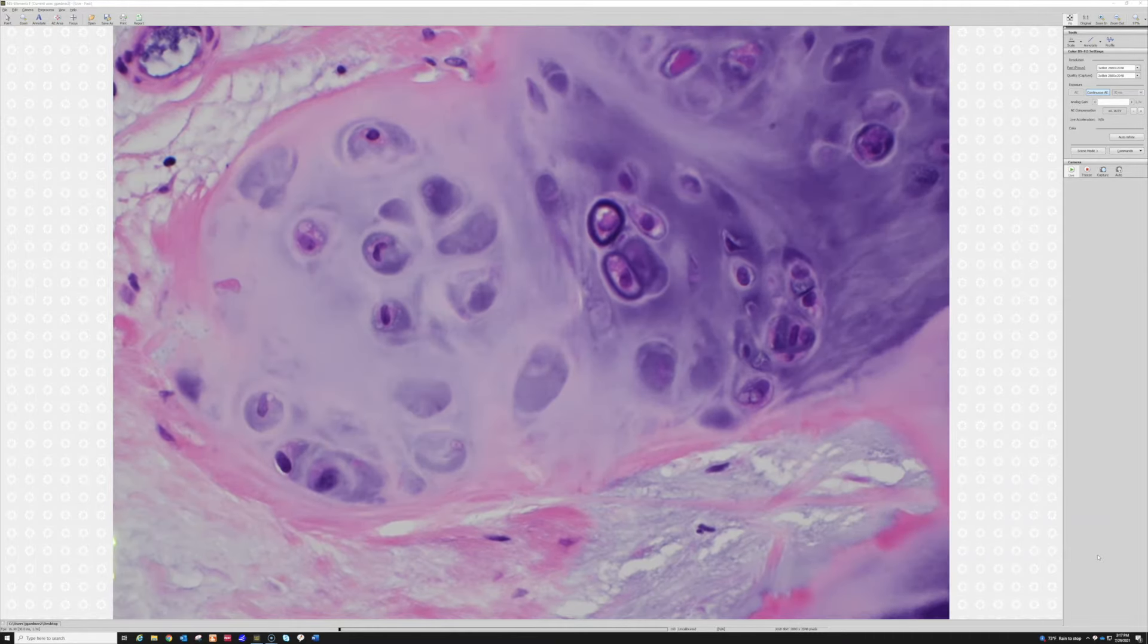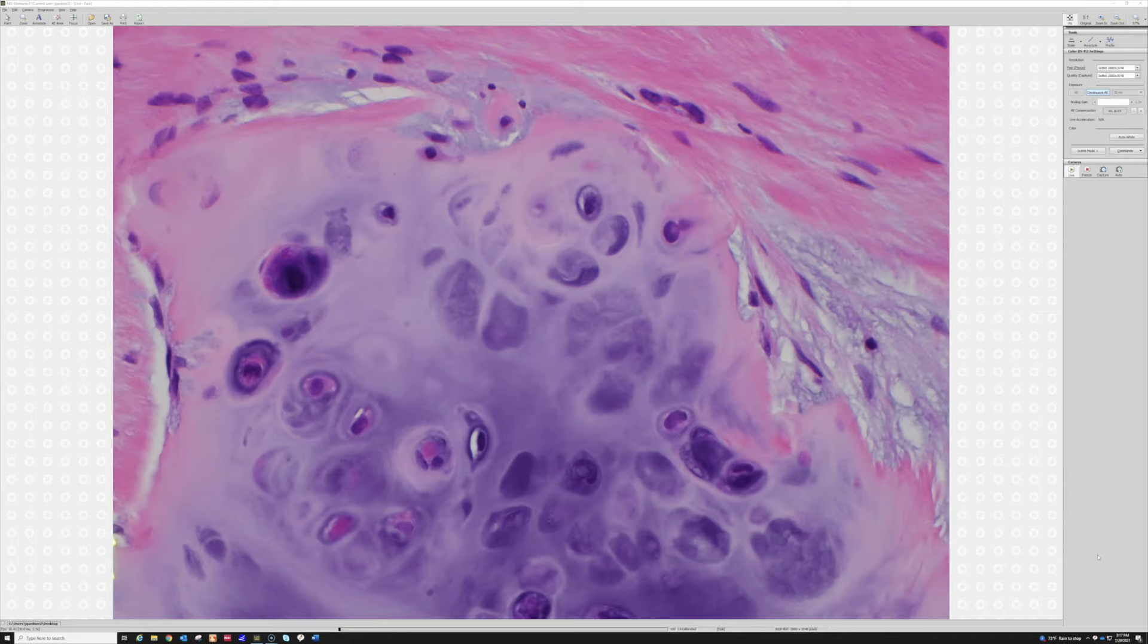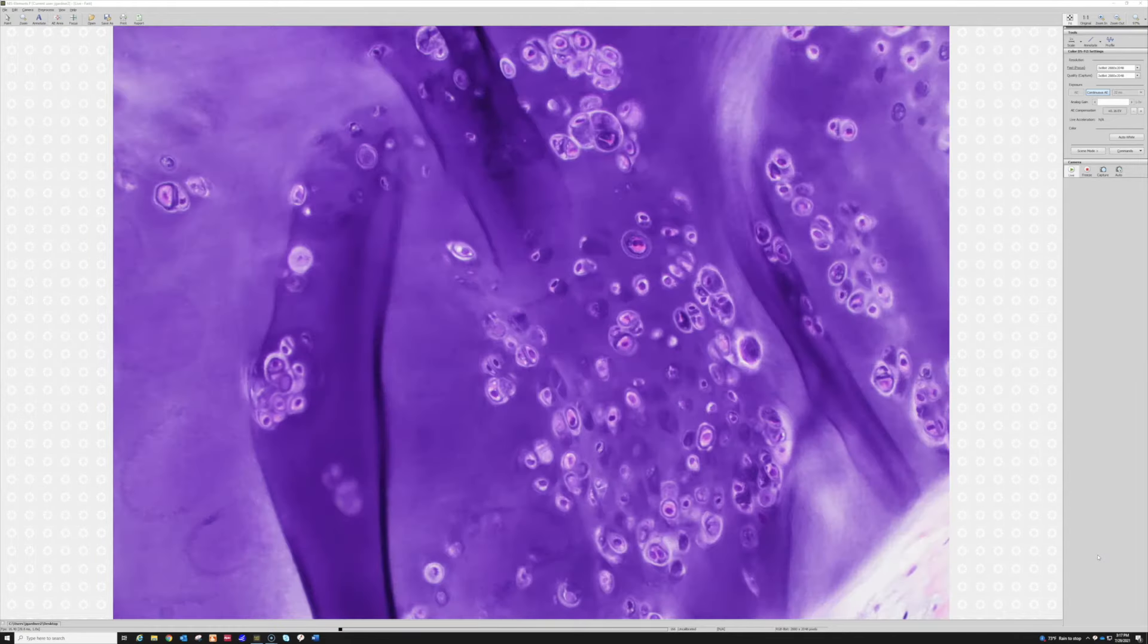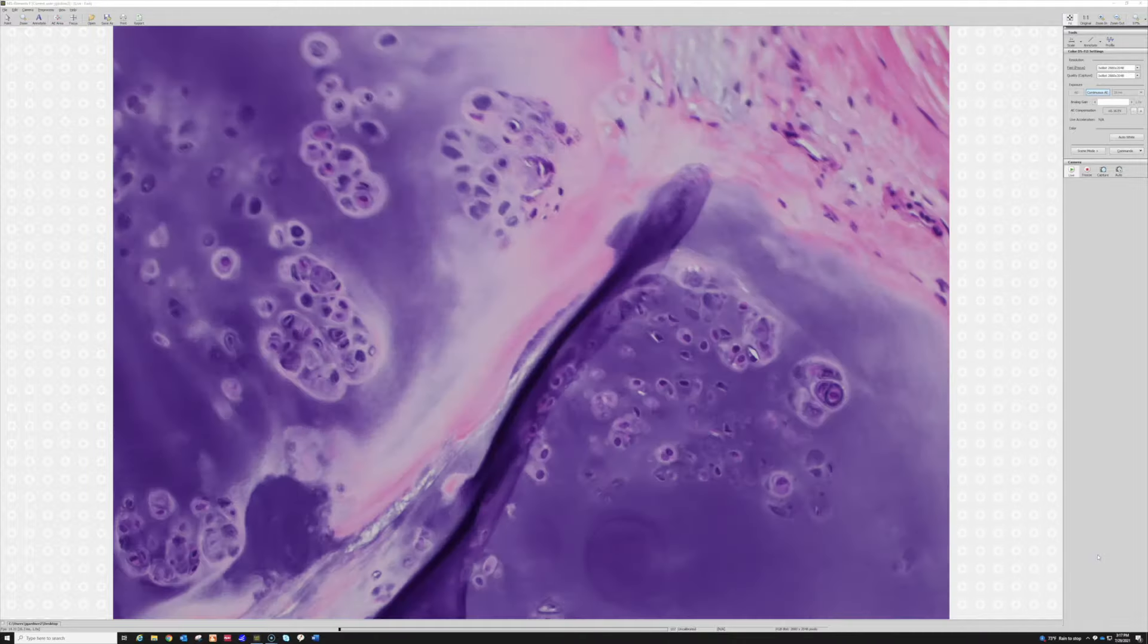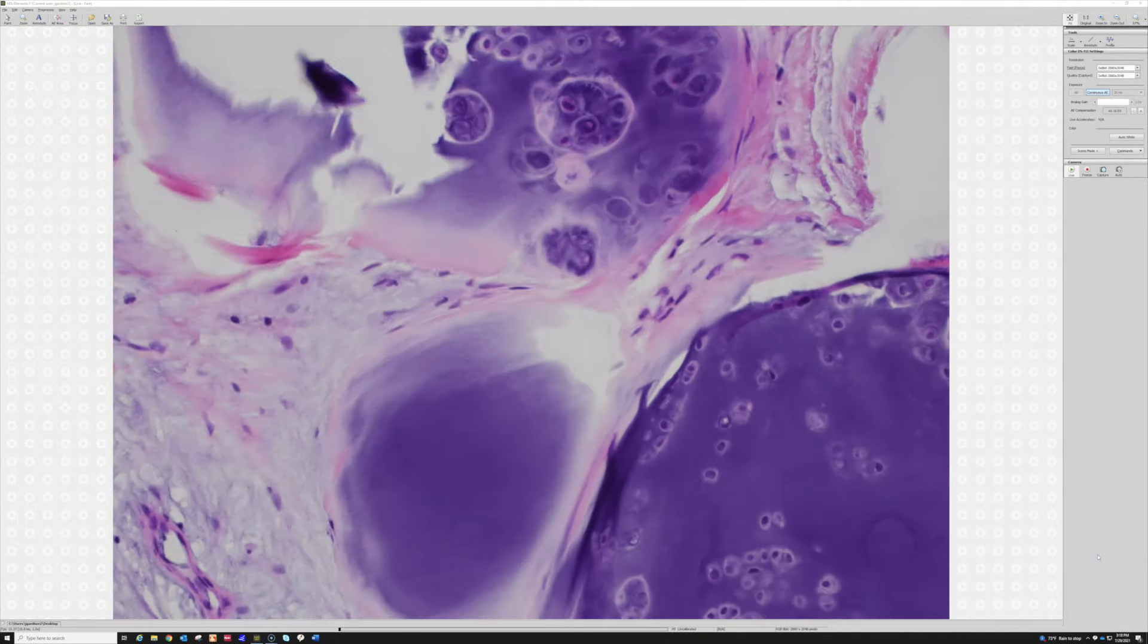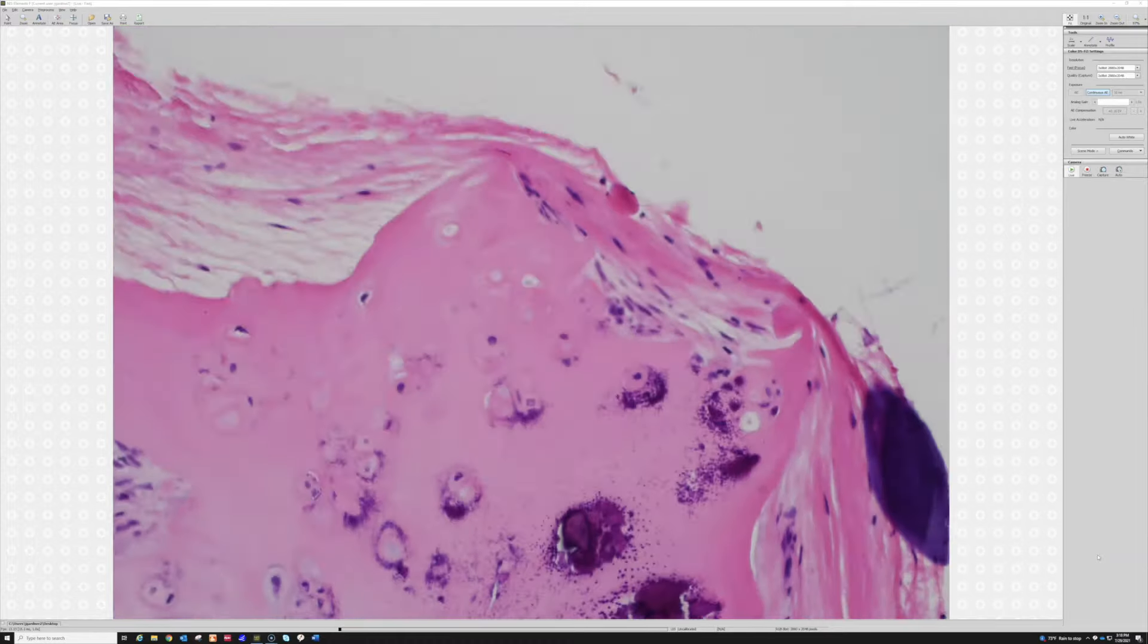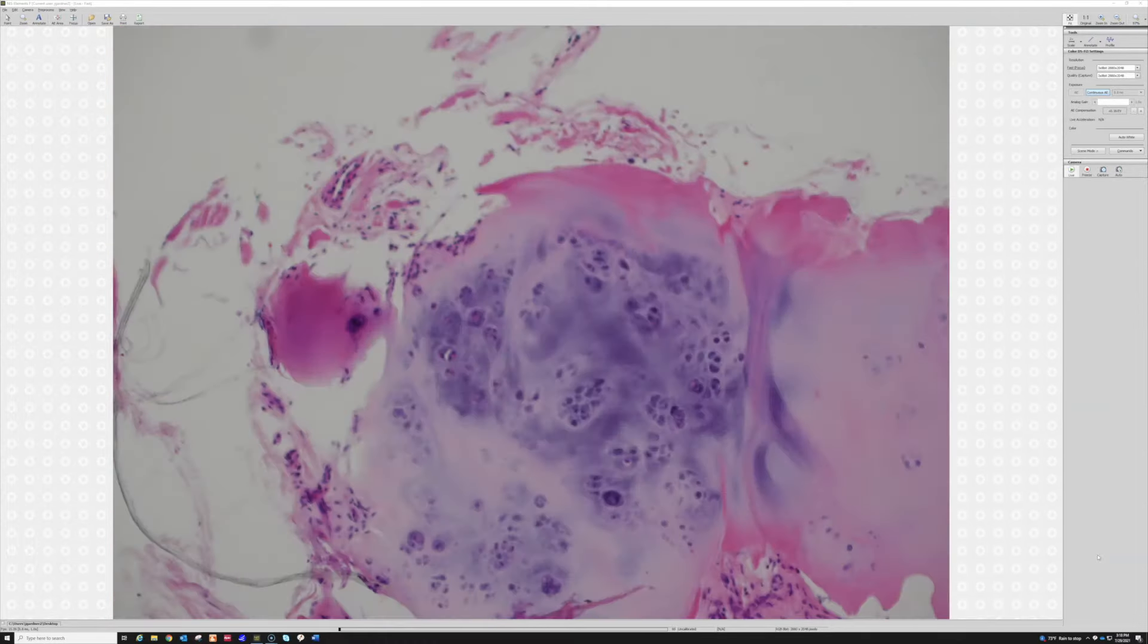So even though it is more cellular than a cartilage tumor like inside the bone would tend to be, in this setting that cellularity doesn't bother me at all. So that's synovial chondromatosis and it's got some calcifications in it.